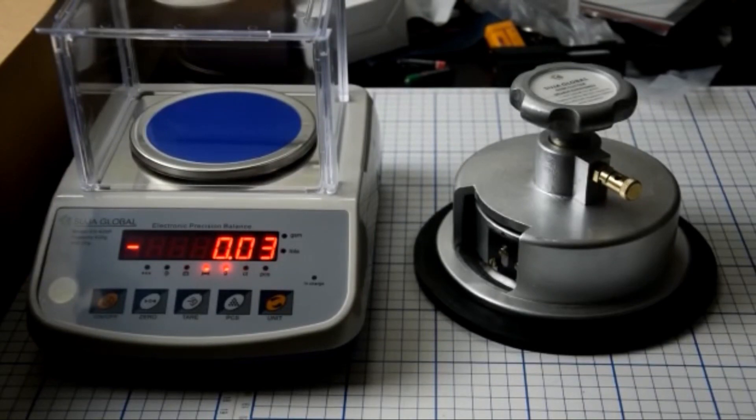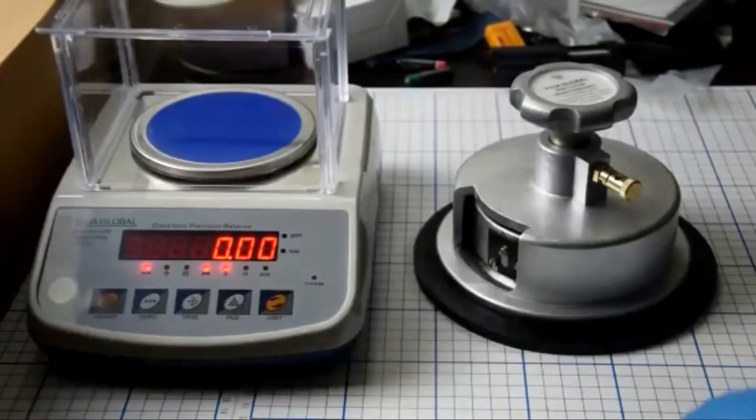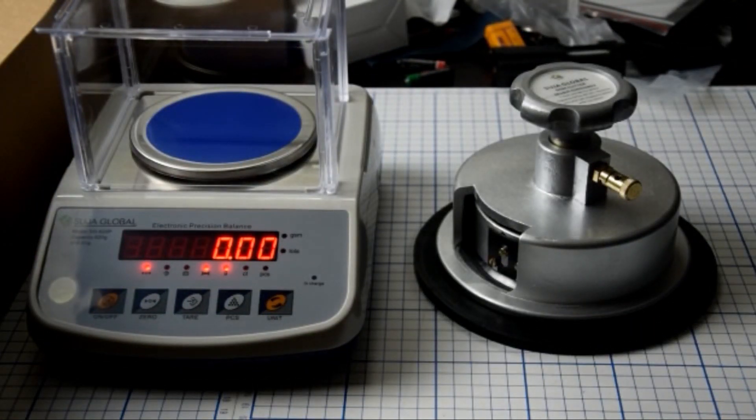Okay, here is the cutter, the same brand, SUSA Global. We are selling this as a package. I'm going to show you the cutter and the weight.